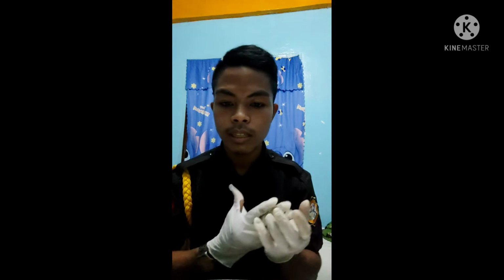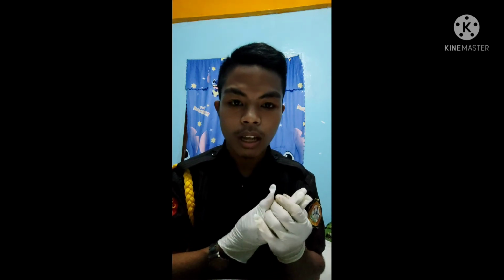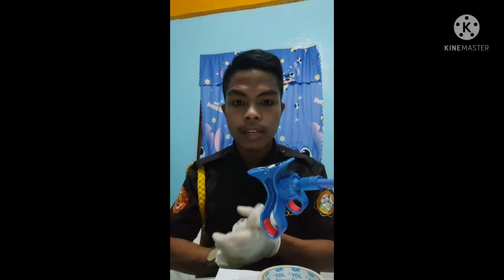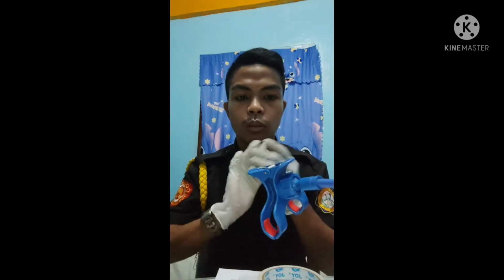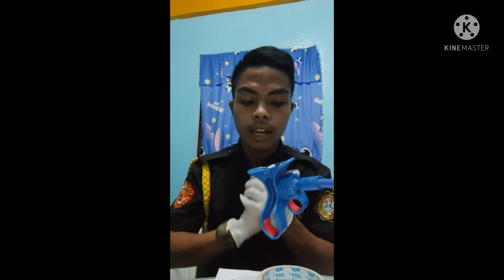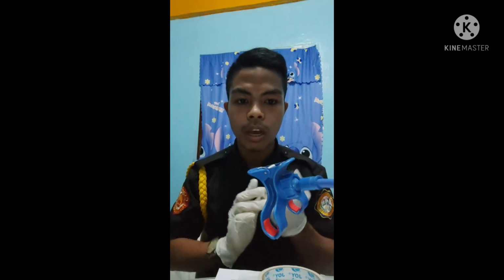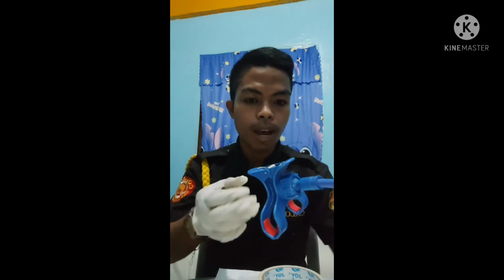Now we are going to conduct a confirmatory test to confirm that this is blood, so that we can assure that this specimen really contains blood. We will use a microscopic test for blood.